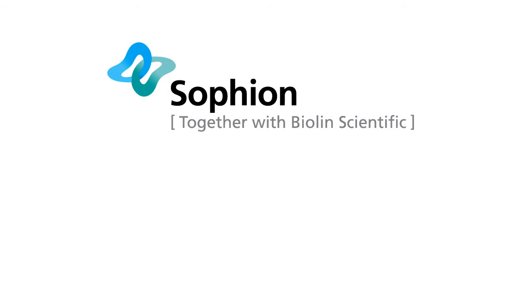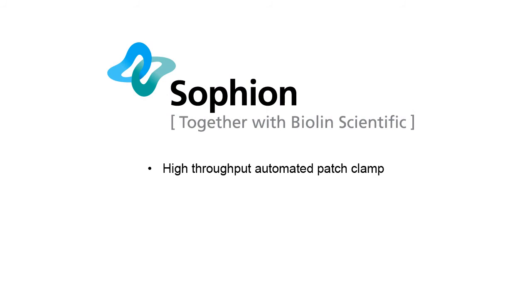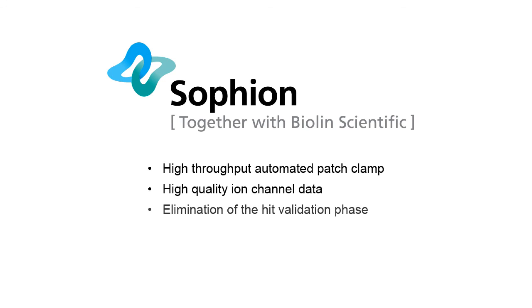By introducing Qube, Sophion delivers true high-throughput screening to the automated patch clamping market. The Qube provides high-quality ion channel data, eliminates the HIT validation phase, and is easy to operate and enables hours of personnel walk-away time.